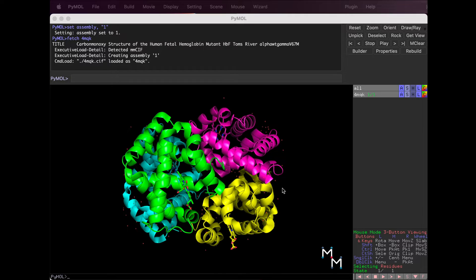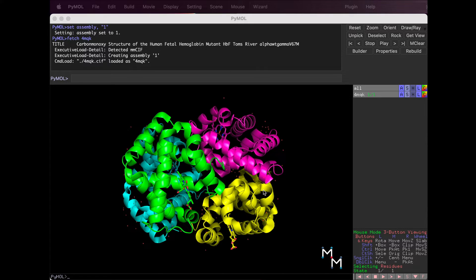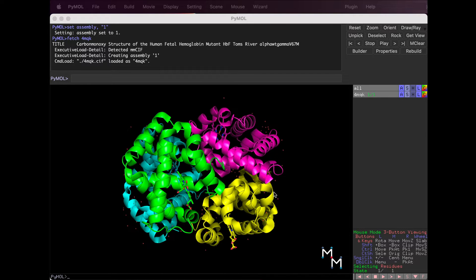PyMole used to pretty much require a mouse, and you may still prefer to use one. But updates to the GUI have made it really easy to use PyMole with a trackpad, and that's what I'll show in this tutorial.